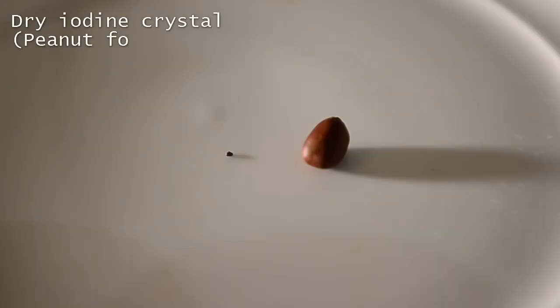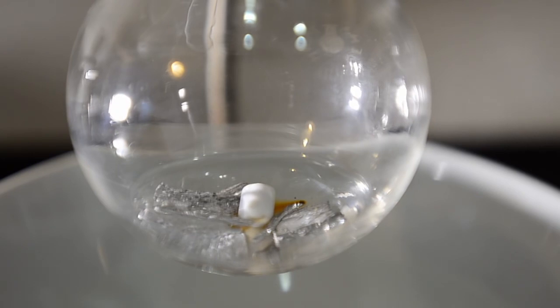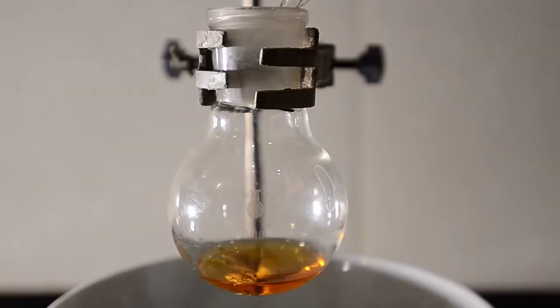Then we got a tiny crystal of dry iodine, there's a peanut here so you can see the scale of this. We put the iodine into the flask with the ether and magnesium turnings. Then we added a small amount of the methyl iodide in ether solution.